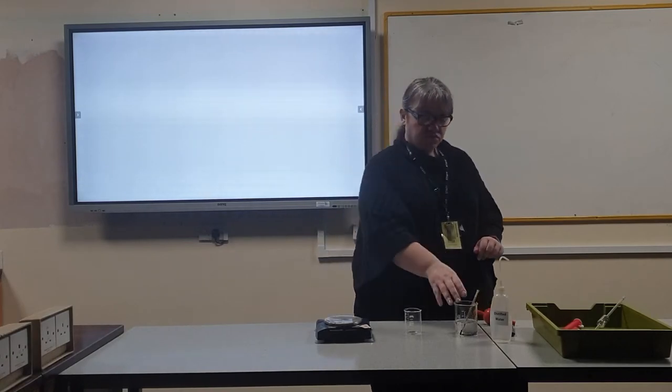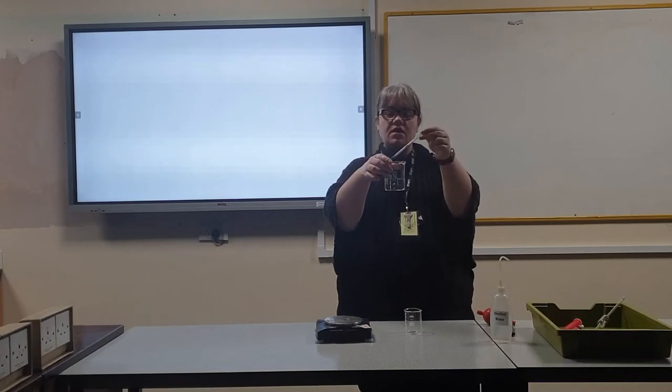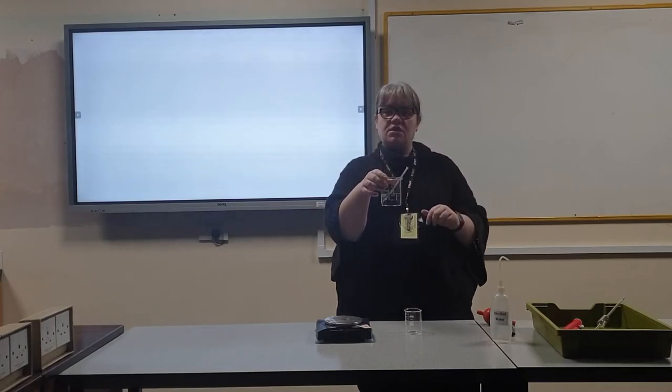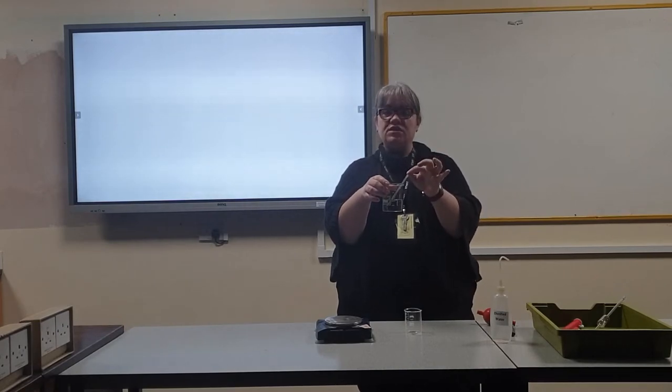I have already rinsed all of the glassware with distilled water and let it dry. Pour some distilled water into the larger beaker and put in the thermometer. Leave this for at least 10 minutes to reach room temperature, then record the temperature that is written on the thermometer.